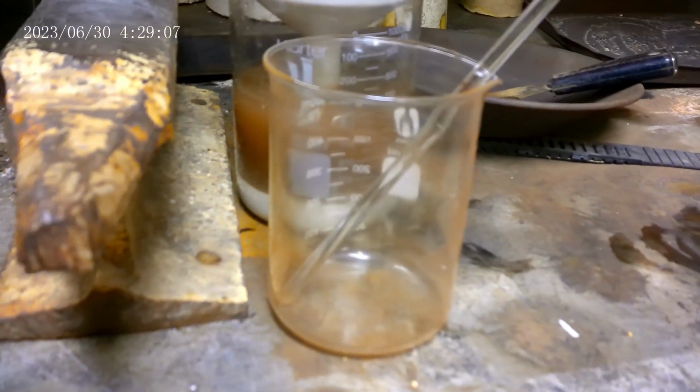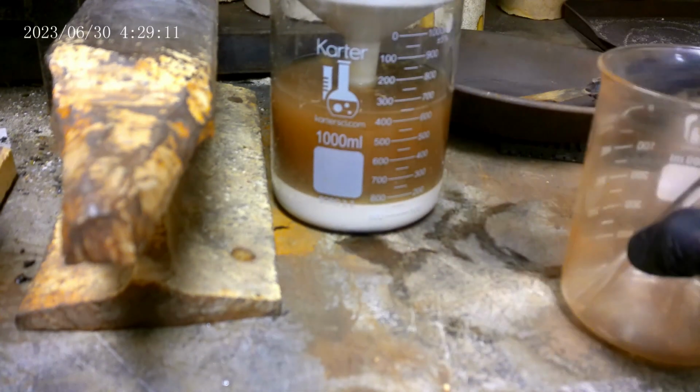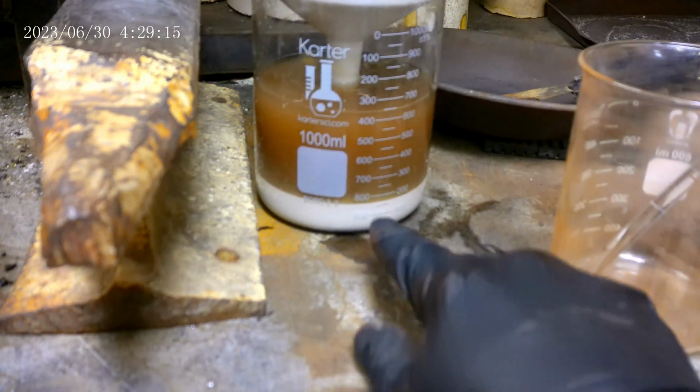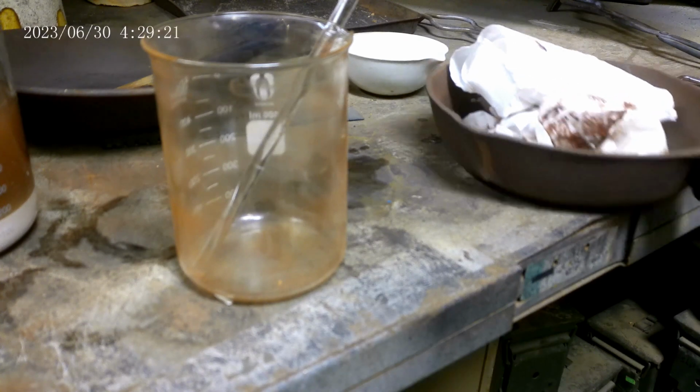Okay, so we got it all filtered. Had to wipe that out with tissue. There's the different layers. That bottom layer is mostly the acid. This is the rinse water. And here I had to use tissues, and those are the filters, and I'm going to have to burn them all off, and then I will smelt all that mess.